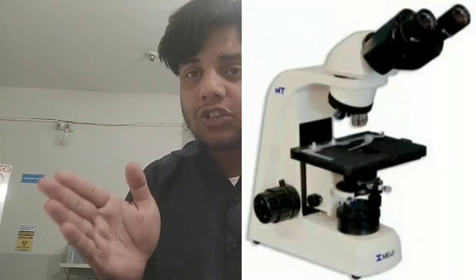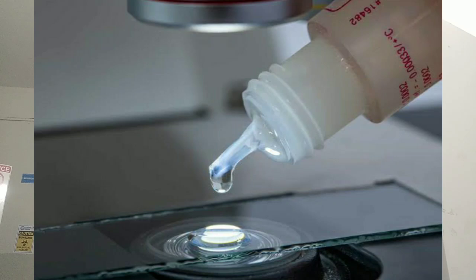Once it is dry, what will you do? You will place it on the stage of the microscope and add the oil immersion. Then you will observe it under the microscope at 40x or 100x power, 100x oil immersion power.